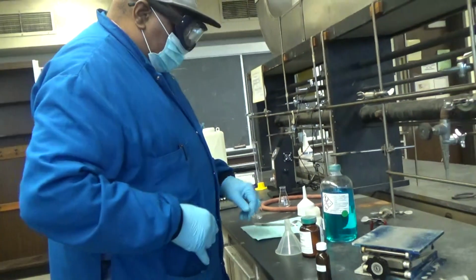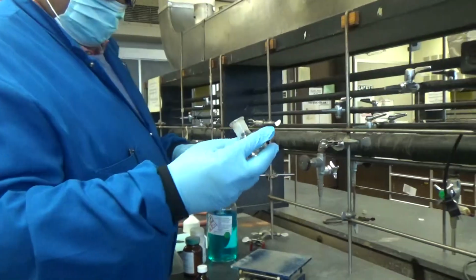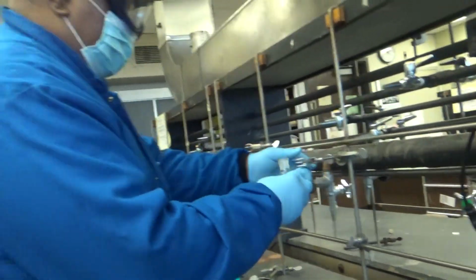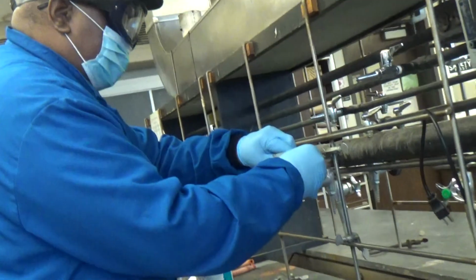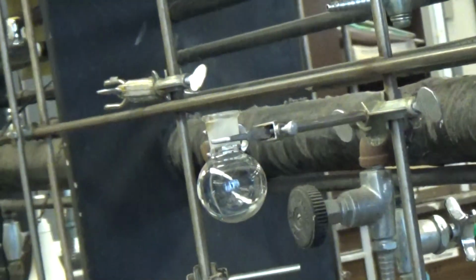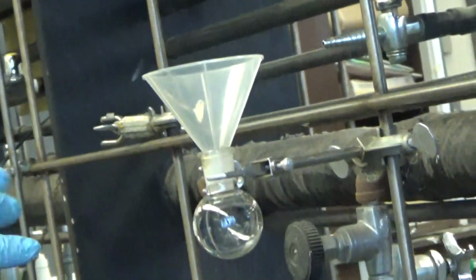So the first thing we do, we have here the round bottom flask, and we clamp the round bottom flask. Now we need to fill it.